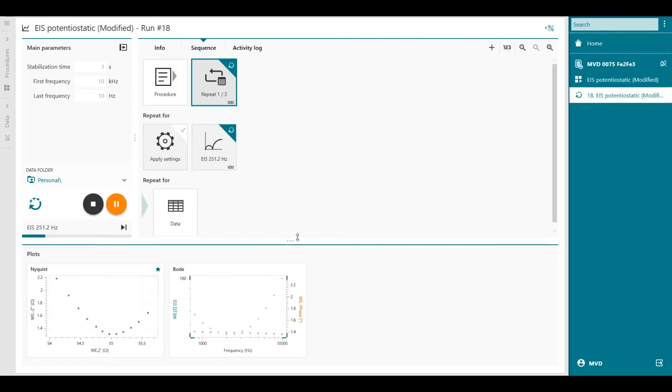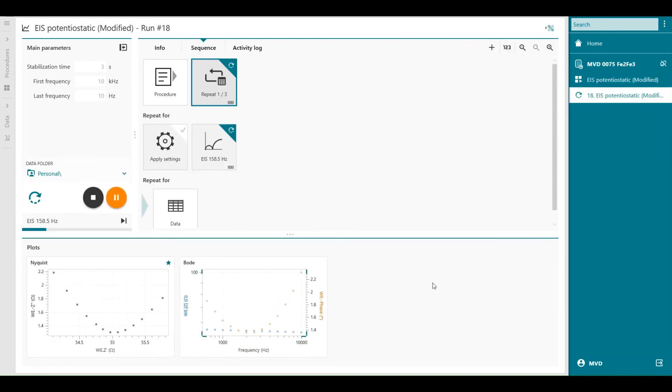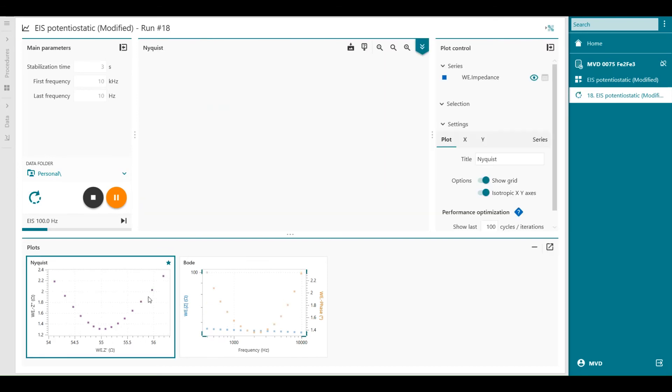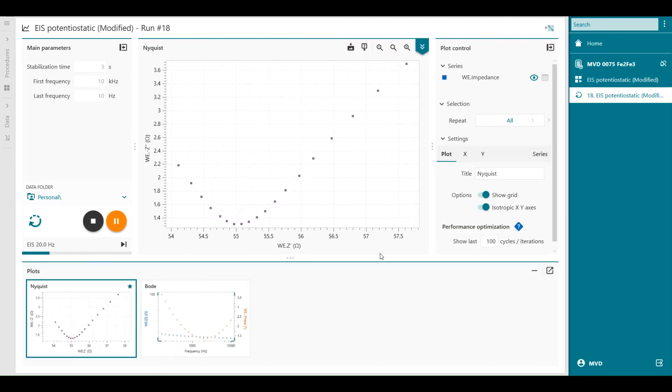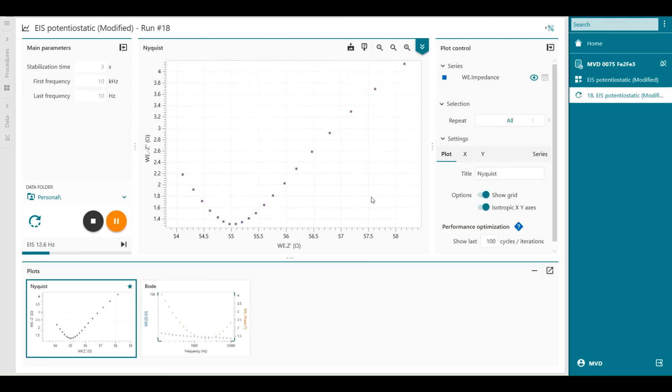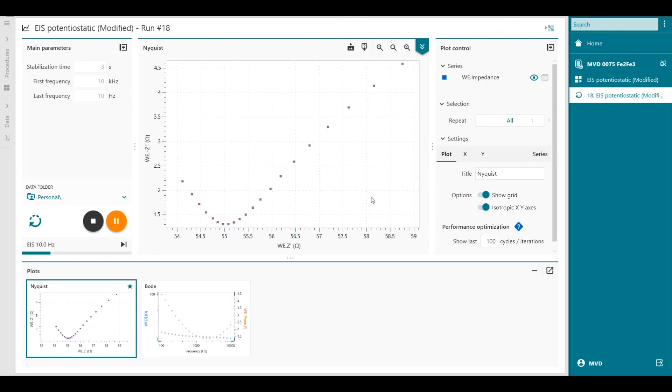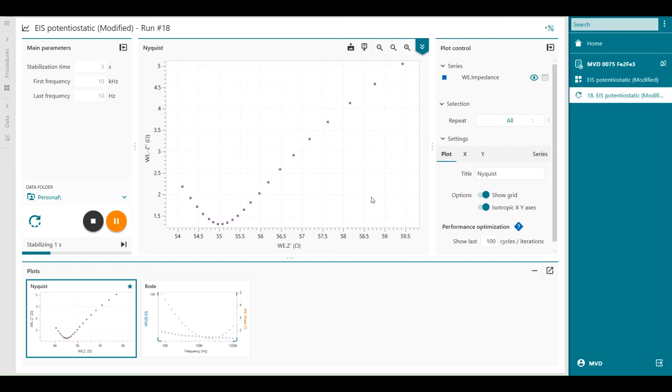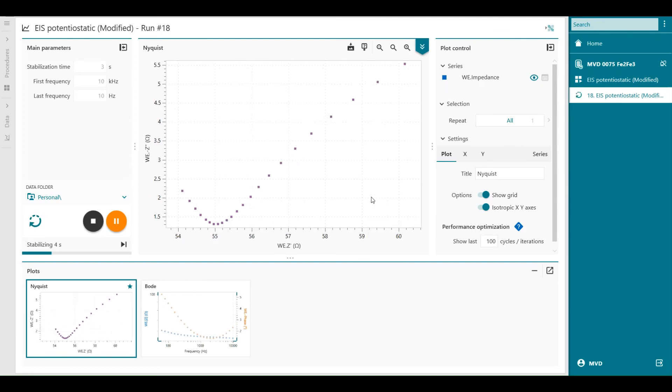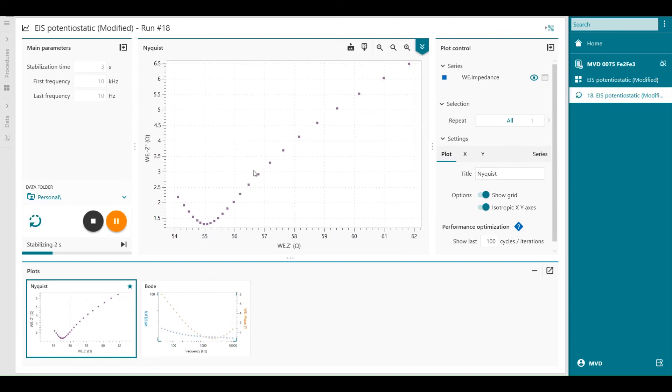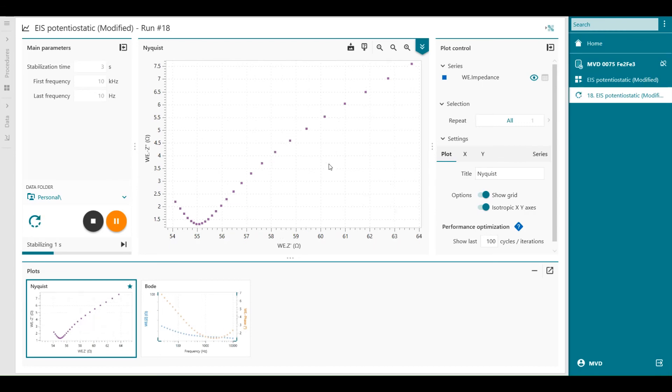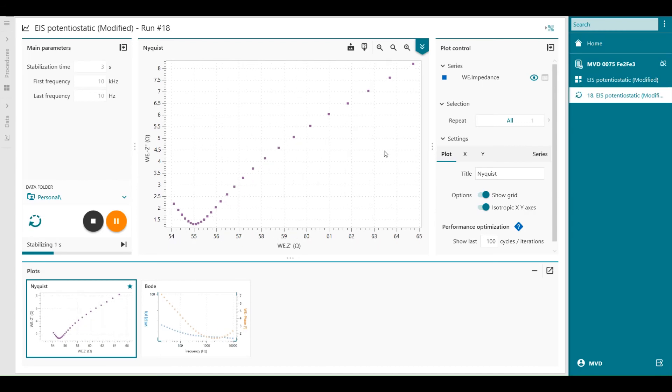This is the measurement. So here's my data. We can enlarge the Nyquist plot by double-clicking it. And we can follow how the Nyquist plot is building up.